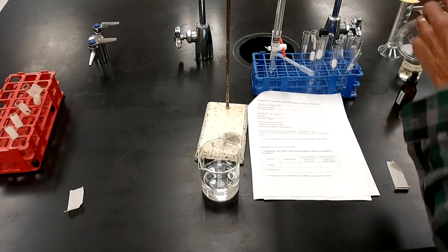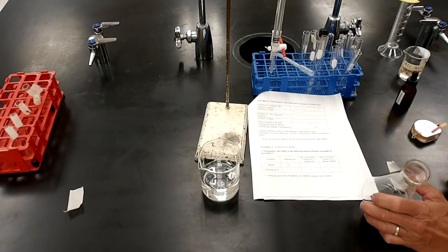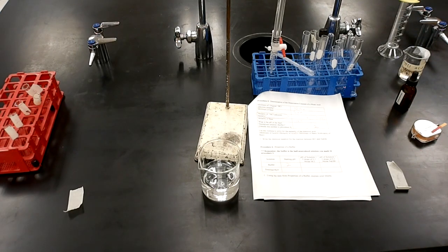Then I'm going to get just some plain distilled water. I'll go back to the sink and grab some.